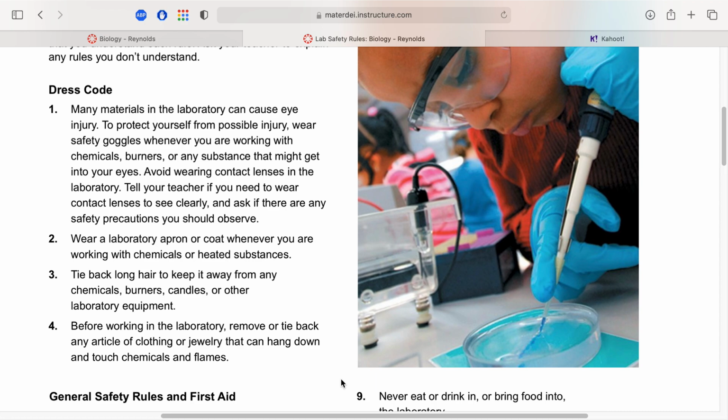These are test tubes that would be held in a rack because otherwise they just kind of take off and roll. And this is a Petri dish that will have an object, sometimes has a cover on it. We could grow bacteria and stuff in agar with that. This is called an Erlenmeyer flask, or flask. It has a narrow opening and that is useful for just spinning it and kind of mixing without having a stirring rod. And so it's a little bit more spill proof. So you need to know the names of those guys.